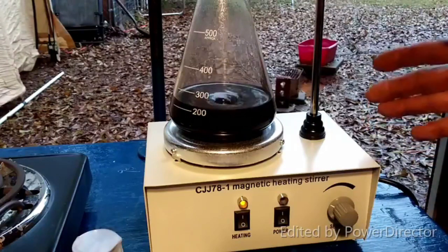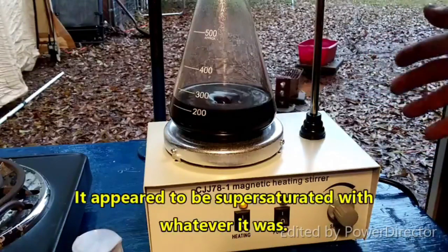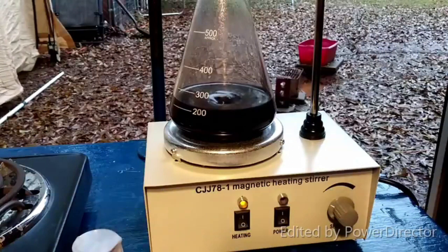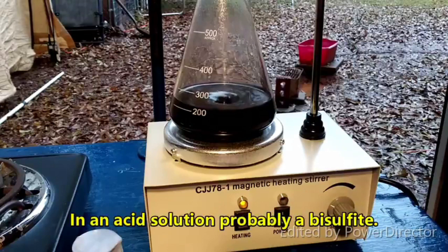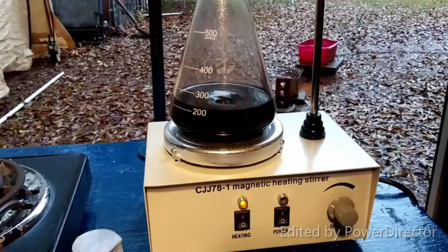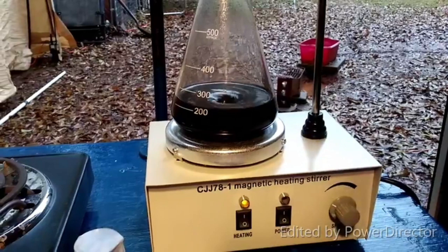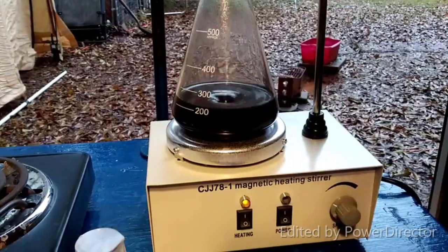But it immediately produced large crystals of this clear precipitate, which I assume was some kind of platinum sulfite compound, perhaps? Bisulfite compound? I was reacting sodium metabisulfite with about 6 molar sulfuric acid in order to generate the sulfur dioxide, so whatever you would get out of that. I added a little bit of water to it. It was freely soluble in water. And decided to go ahead and hit it with borohydride.